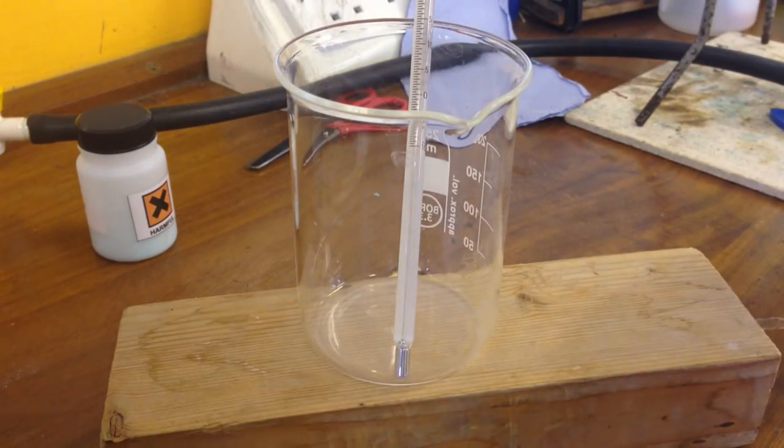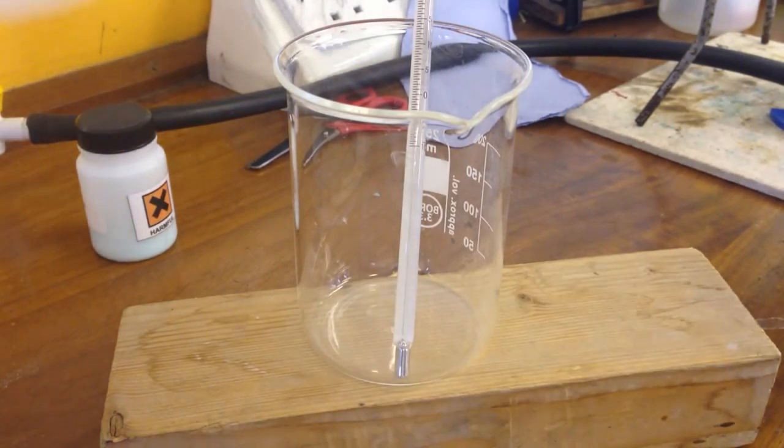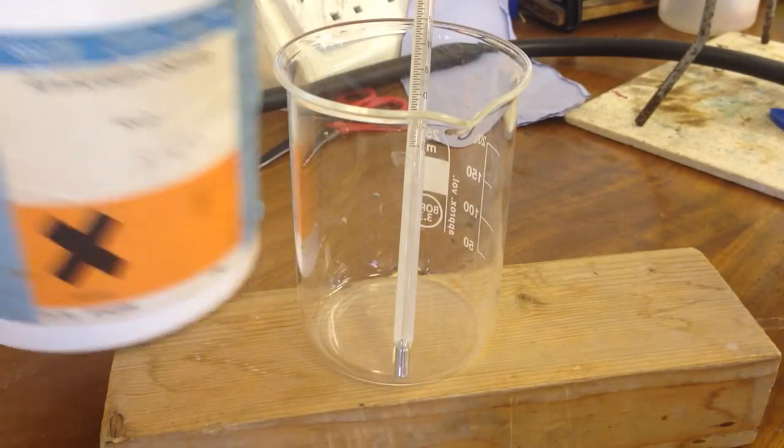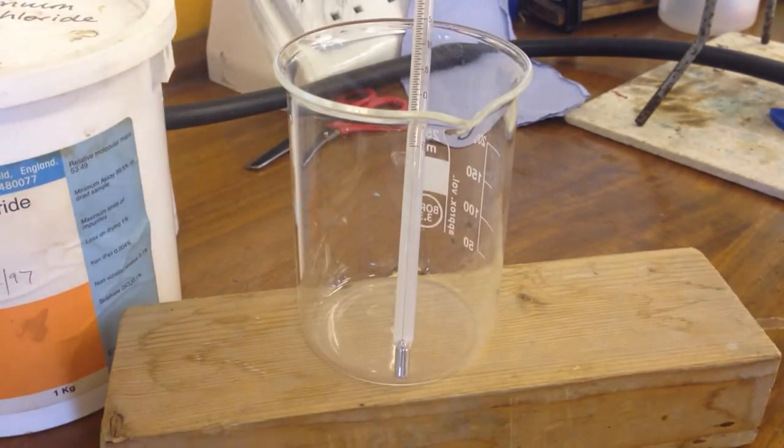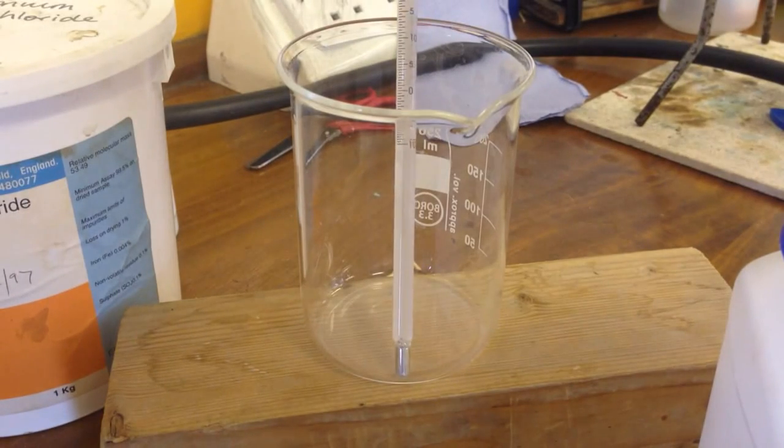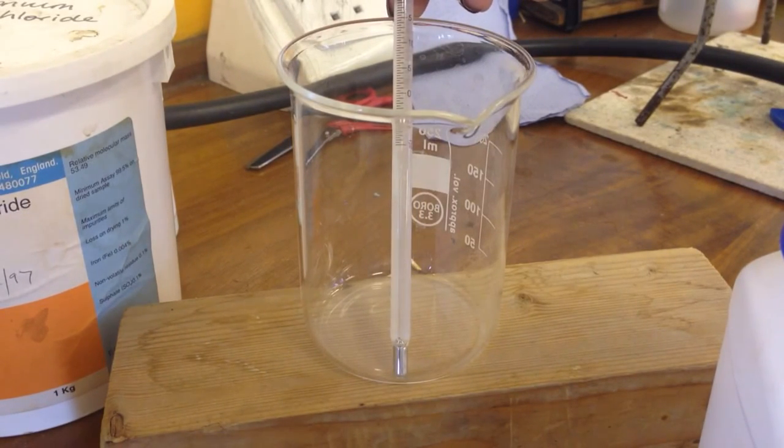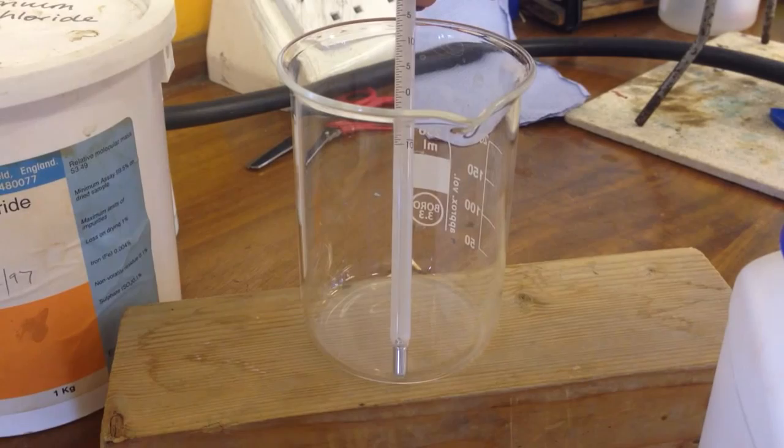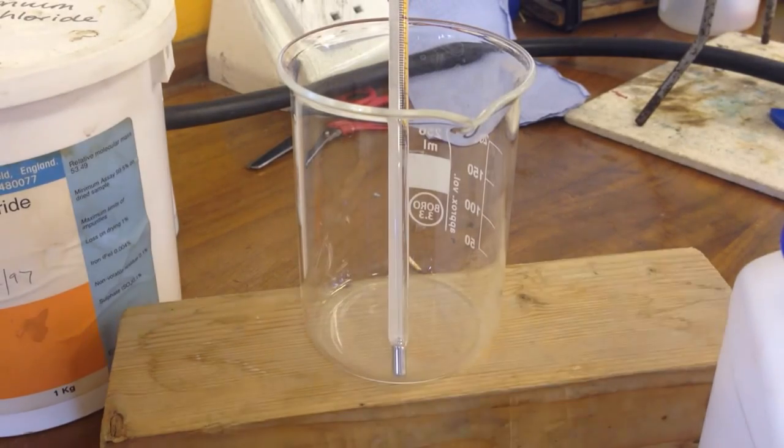In this video, I'm going to show you an endothermic reaction between ammonium chloride and barium hydroxide. So I've got my thermometer in here so we can keep track of the temperature. It's currently reading about 18 degrees in the lab.